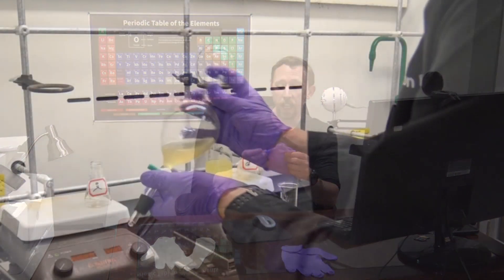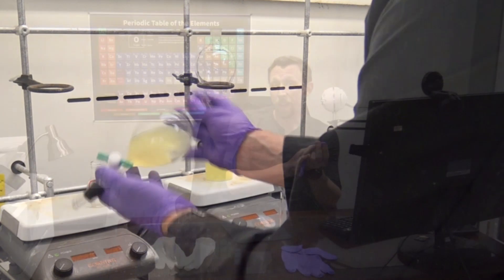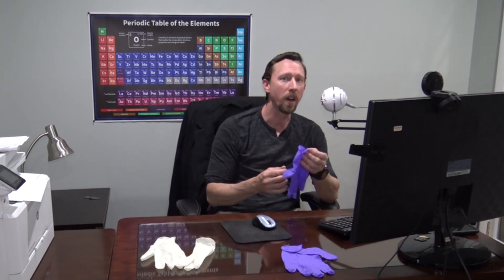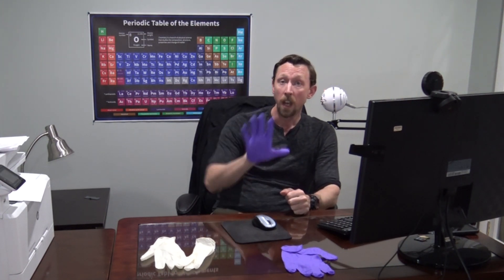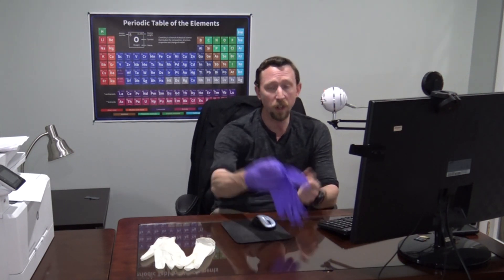We prefer to use nitrile gloves in our teaching labs because they have different resistance to solvents than latex, and they meet our needs better. But when it comes to keeping things like pathogens off of our hands — bacteria and viruses — either one should work quite well. When you have them on, you need to remember a few things. The first is: gloves don't make you invincible. If you have a glove on your hand, touch a contaminated surface, then touch your face, you might as well not have the glove on. Gloves can still transfer and transmit materials just like your bare hands can. So if you're going to be wearing gloves, be sure you're always cognizant of normal safe behavior, including not touching your face and being careful not to touch surfaces you don't have to.